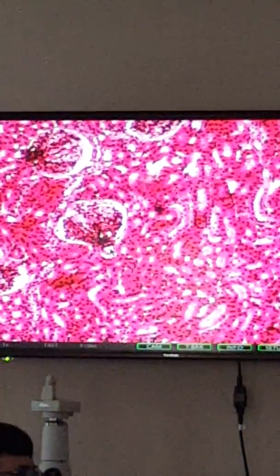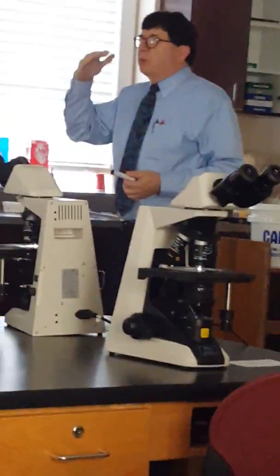Now I'm going to tell you a little secret about the DCT. A lot of times, because the distal convoluted tubule and the proximal convoluted tubule are very tortuous, forming curves and turns, you can't catch them longitudinally because they're constantly turning, twisting. So you're always catching them in cross-section up within the cortex.